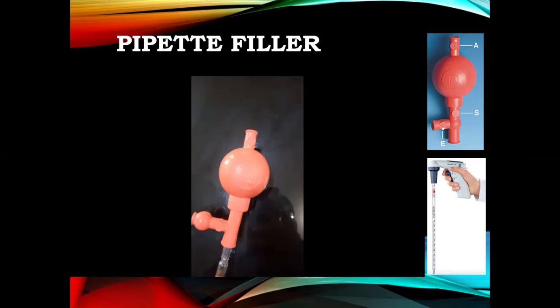Then you have to drain the liquid. So for draining the liquid, we press this E. E means empty the pipette, or eject. Eject means to release the liquid into another container.